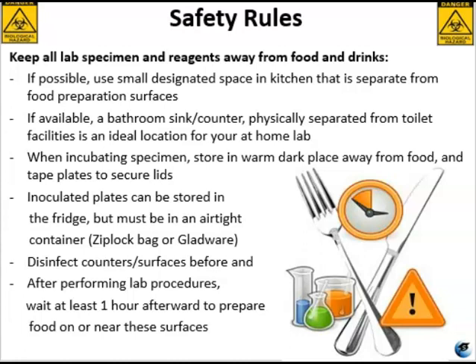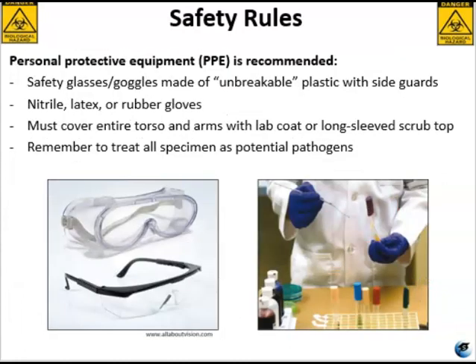You want to wait at least 1 hour after disinfecting those counters before you prepare any food on or even near those counters. Personal protective equipment, PPE, is recommended. I am aware that it may not be available at this time for all students. So at the very least, you want some form of protection for your eyes, hands, and your torso. Eye protection is going to be in the form of some kind of safety glasses or goggles. Hand protection includes gloves. If you don't have access to nitrile or latex gloves, you can use those rubber dishwashing gloves. Those will work as well.